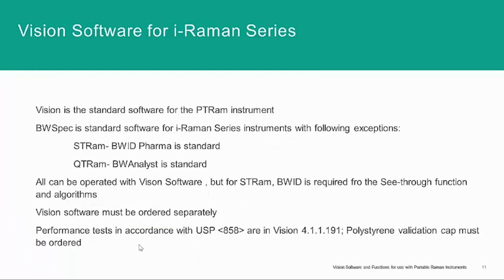So with that, I've gone over the connection to a B&W Tek PTRAM instrument. Vision is the standard software for the PTRAM instrument, and BW Spec is standard for the other iRaman series instruments, with the following exceptions of the STRAM, where BWID Pharma is standard, and QTRAM, for which BW Analyst is standard. But all of these instruments can be operated with the Vision software.